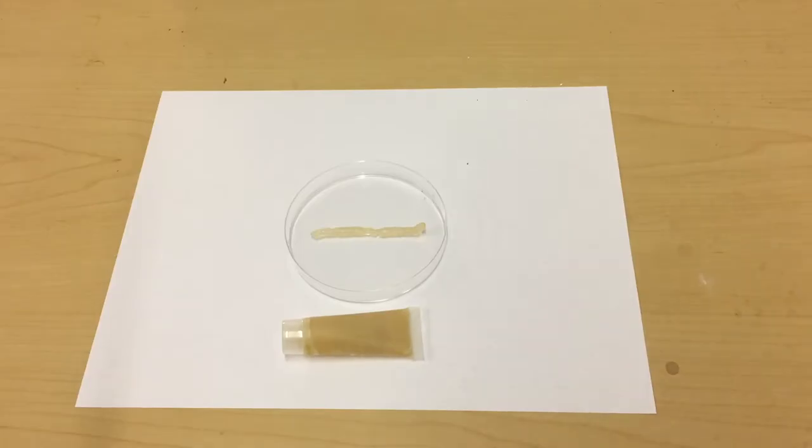The majority of silver gels currently on the market are prone to discoloration after exposure to high temperature. In this petri dish, we have a sample of incorrectly formulated gel. After exposure to steam sterilization, the gel discolors and turns a yellowish tan.